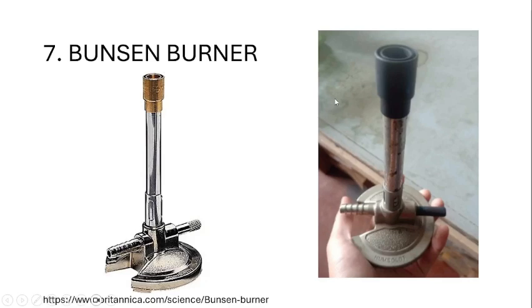So expect that once you start your experiments, you will encounter an actual burner like this. The color is already dark, and perhaps there are markings at the side. This burner will be connected to the gas cock where the source of our fuel is connected, and we will have that more elaborated in experiment 1, part 1.